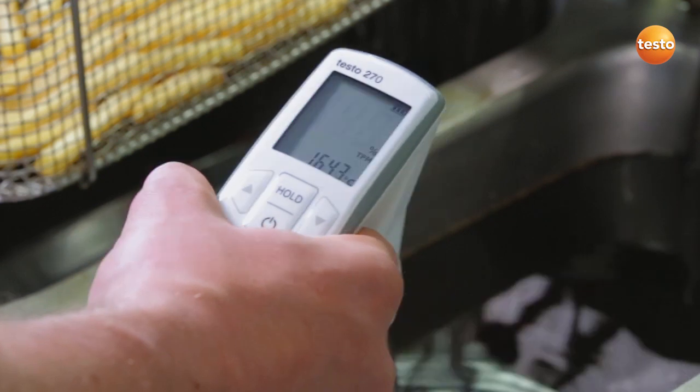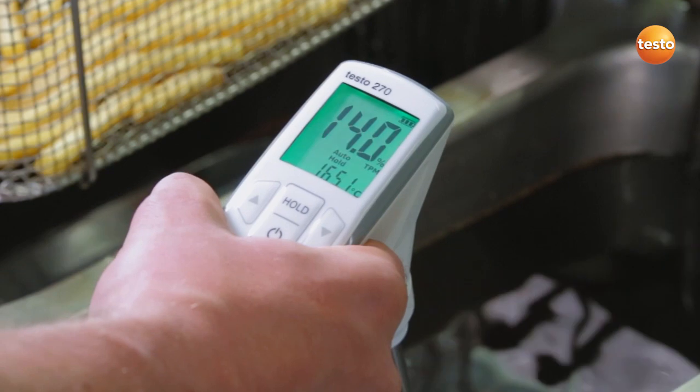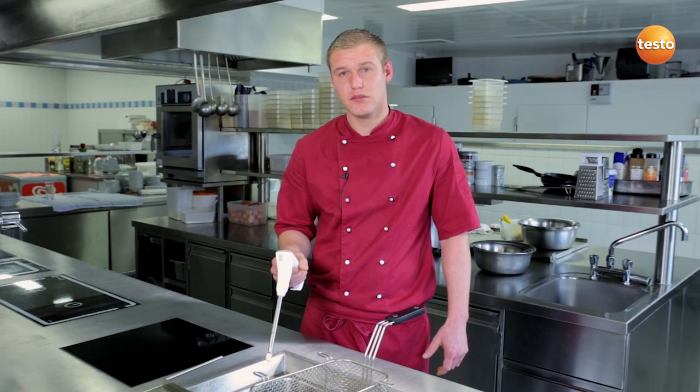In auto hold mode, the display with the readings starts to flash. As soon as the measurement value is stable, the display freezes. That's it. Careful — the probe is very hot, please don't touch it.